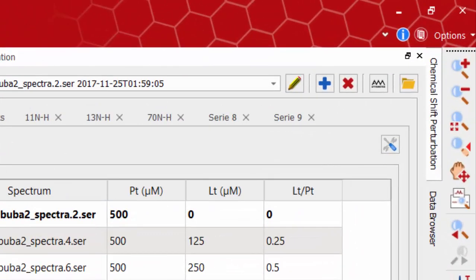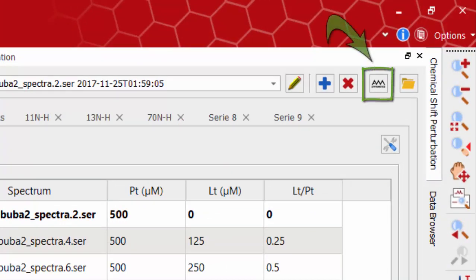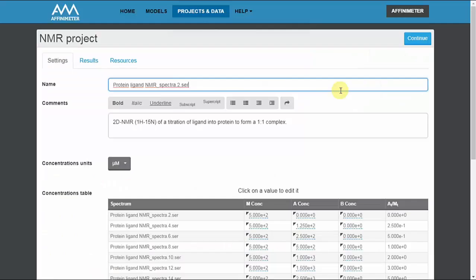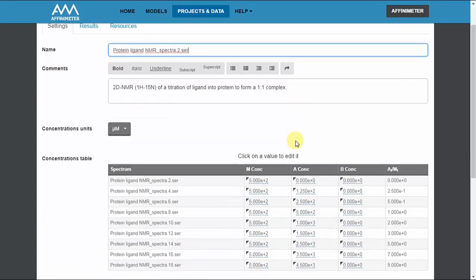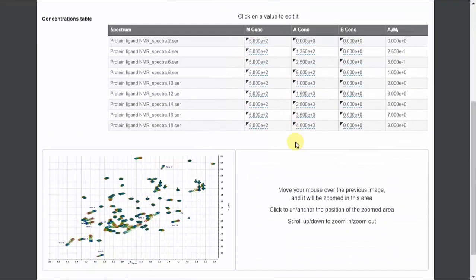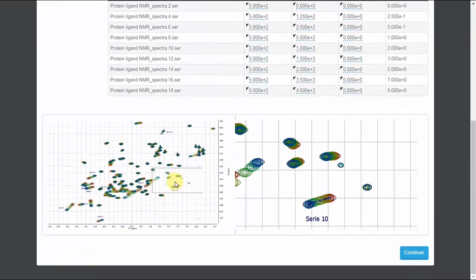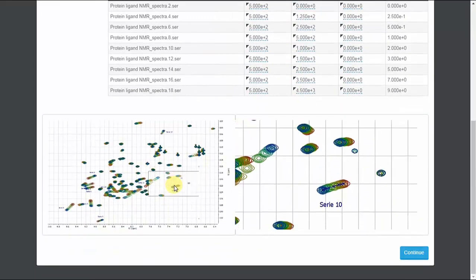From the chemical shift perturbation panel we can also click on the affinimeter button to upload the binding isotherms from these 2D NMR titrations directly into affinimeter NMR module in order to measure the binding constant.